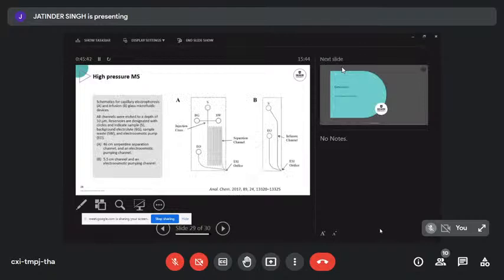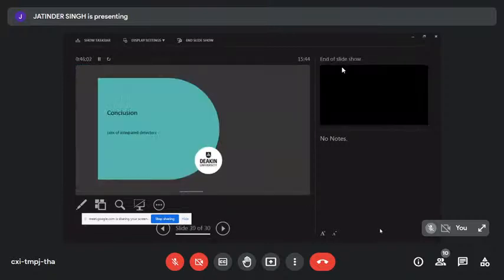There's also high pressure mass spectrometry where they reduce the needs for vacuum for the mass spectrometer to be operated, which now gets the first field portable mass spectrometers in place, which is of course interesting to the microfluidics field. And we'll be looking at that in a little bit more detail when we talk about proteins.